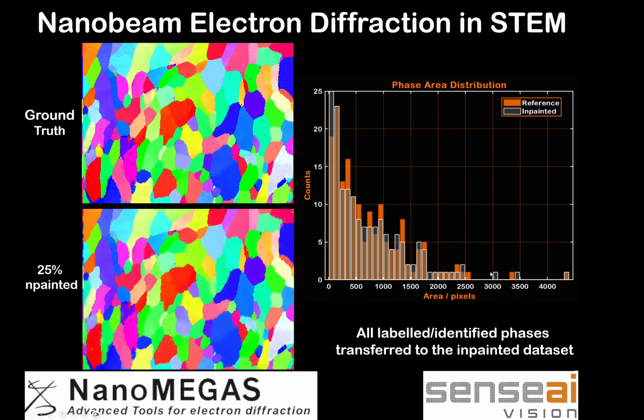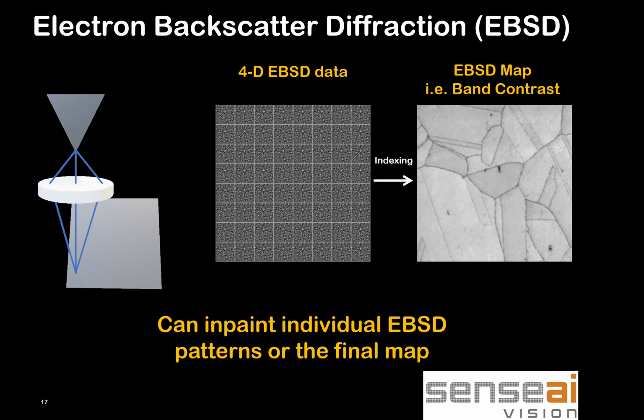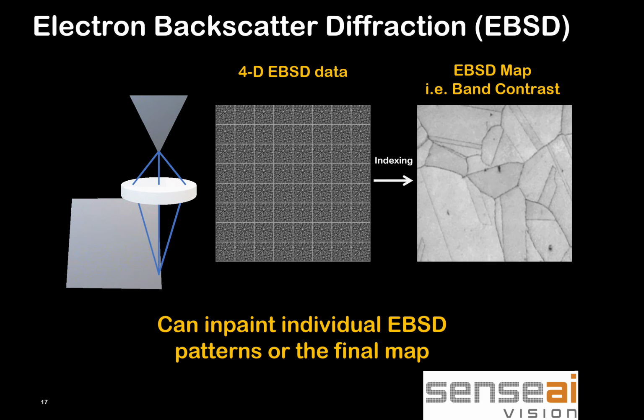Not only that, when you do the distribution of the profile of the grains and the areas, you get pretty much the same histogram. There's a little bit more noise in the 100% one, but effectively you've got the same distribution that's coming out of it. So getting 4 times faster without any problem at all in terms of signal to noise and recovering all the data.